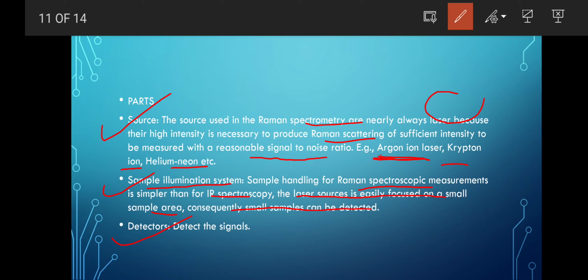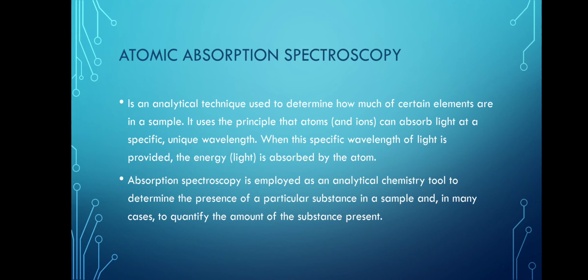Then the detector, it will detect and send a signal. So there will be a computer attached to this system. So here they will produce a bar graph showing what amount of substance is there.